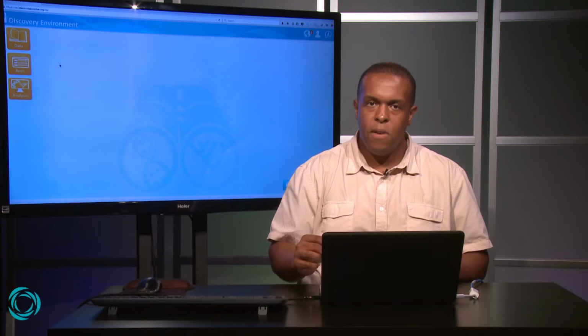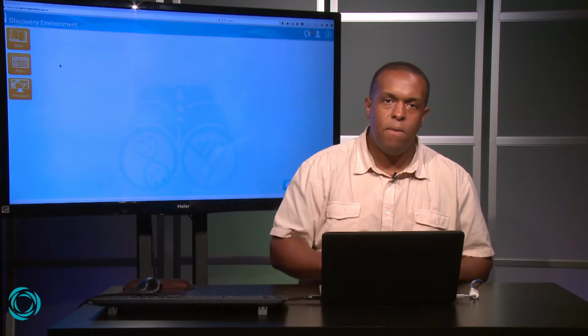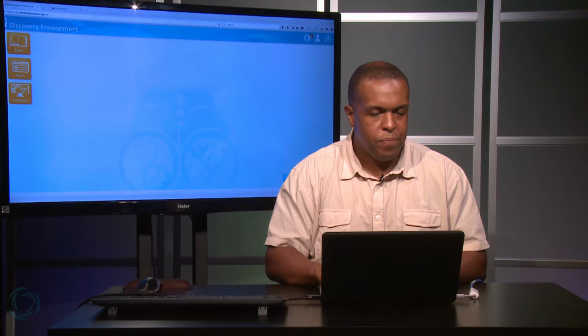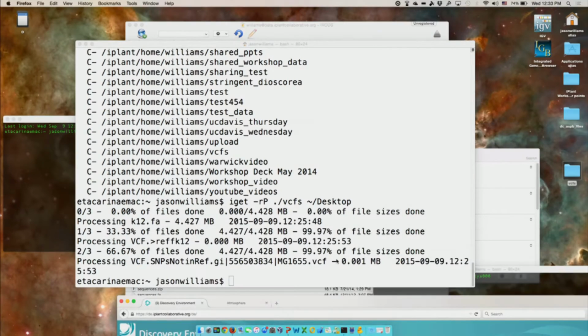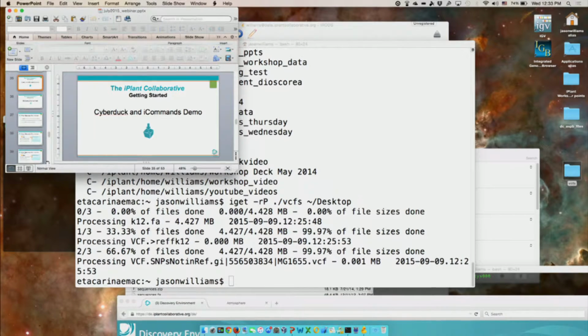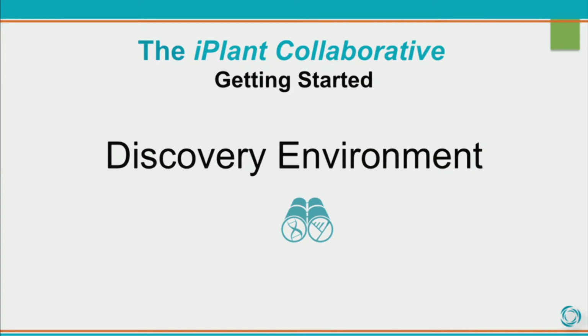So I have a couple more slides to talk about the DE, and then we'll do a very simple analysis. Okay, so let's go back to the presentation. And I've got a whole bunch of windows open now, but here it is behind. All right, so getting started with the discovery environment.